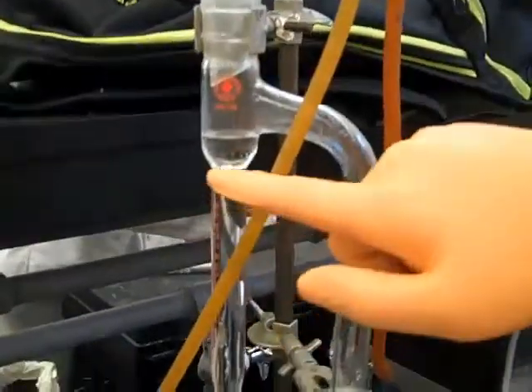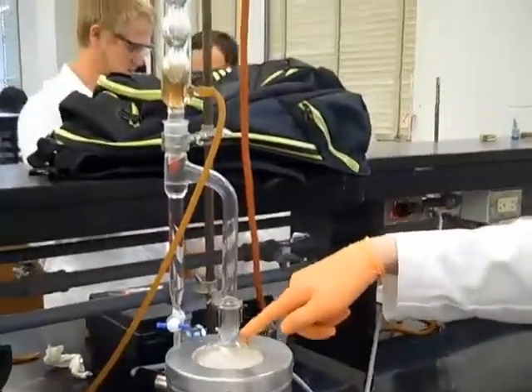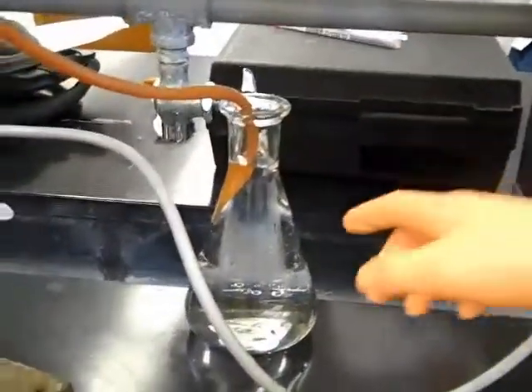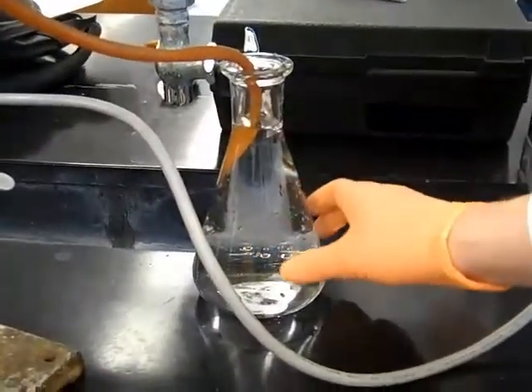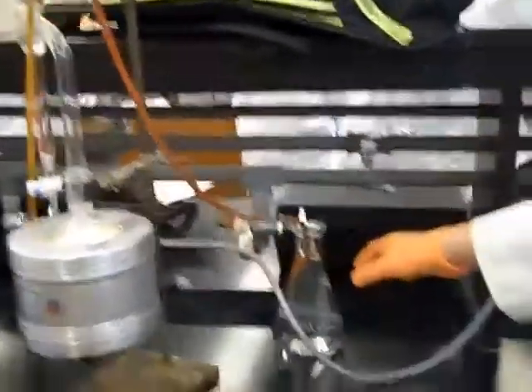Going back, our reflux actually happens right here where the stuff that isn't going through the condenser drops back through here. This is our Dimroth condenser. This is where the excess water is coming out. We have it in here because simply the tube wasn't long enough, so we had to make adjustments — improvise.